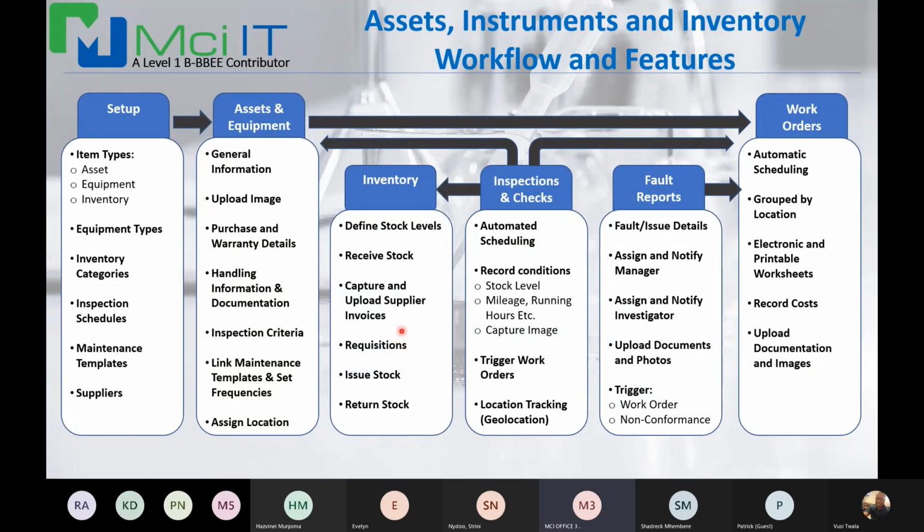Other system users can issue requisitions, so request stock from my warehouse or stores. Stores would issue stock, and there's also a function to return stock. And then obviously, all of these functionalities combined allow you to maintain stock levels for reordering as well.